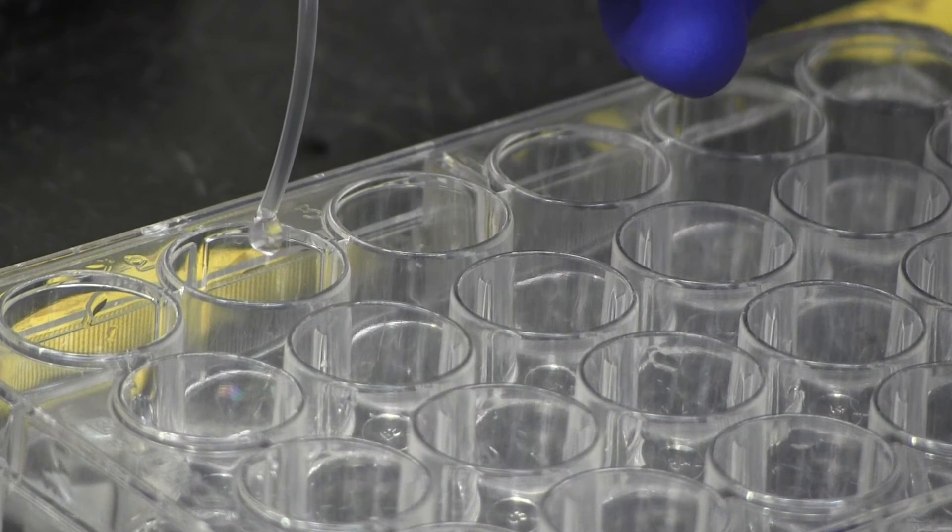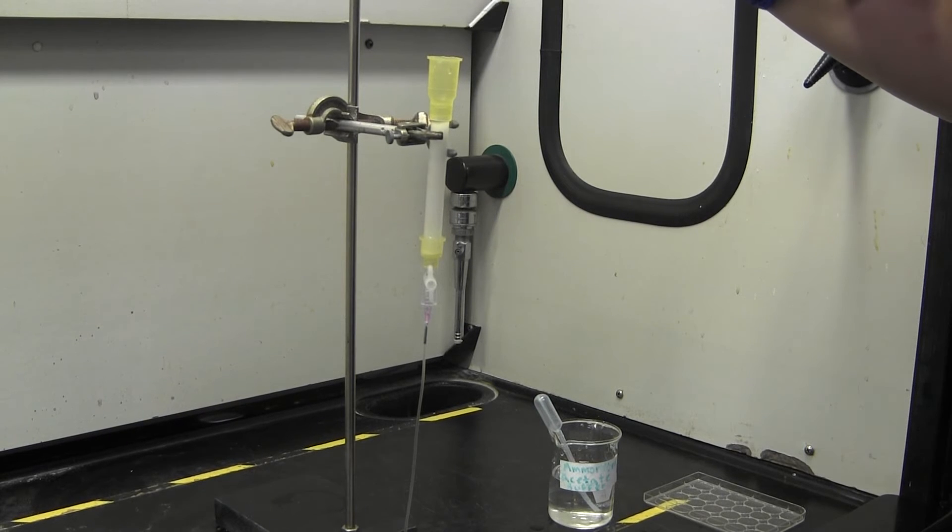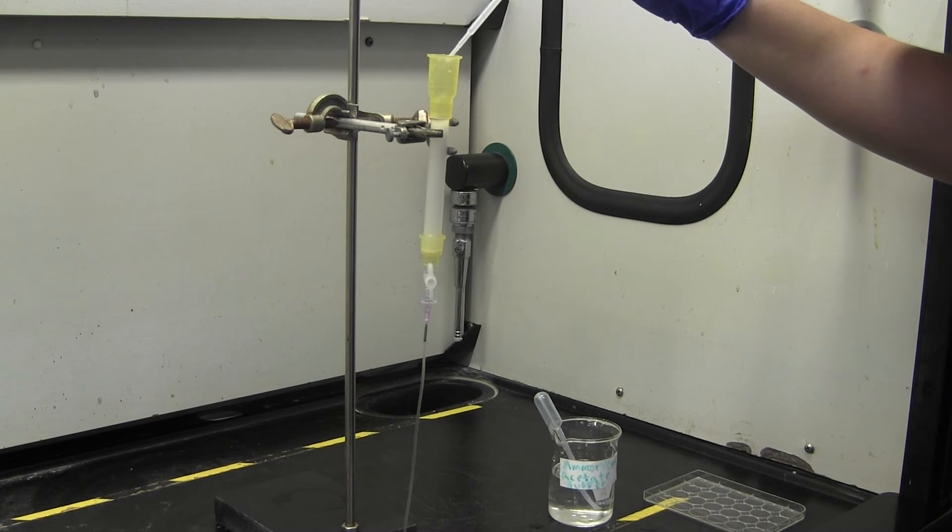Once you have collected 20 fractions, run another 10 milliliters of buffer through the column to clean it. You do not need to save this.